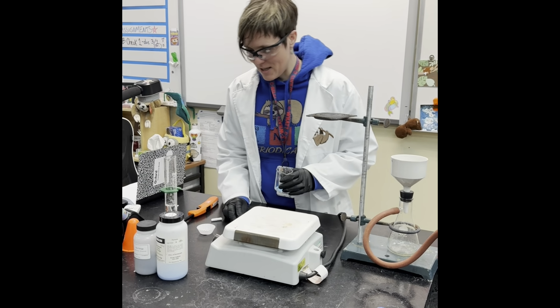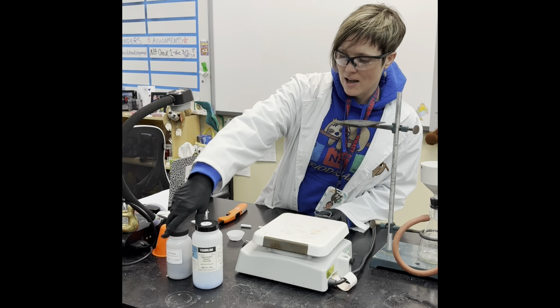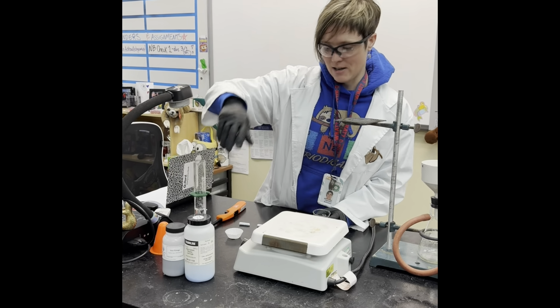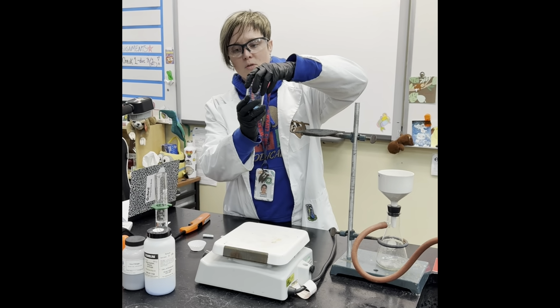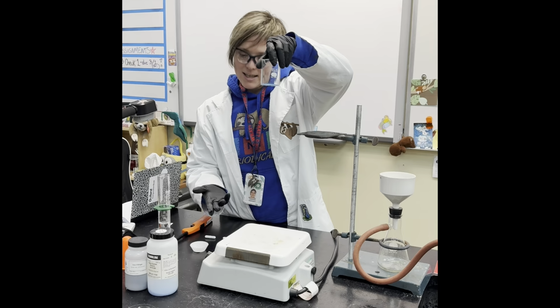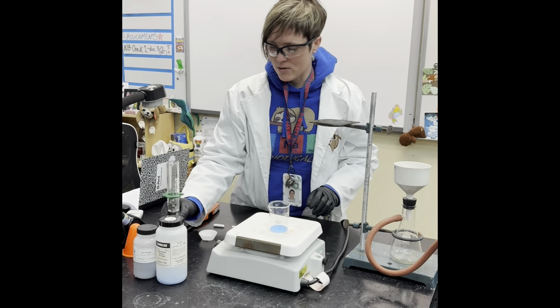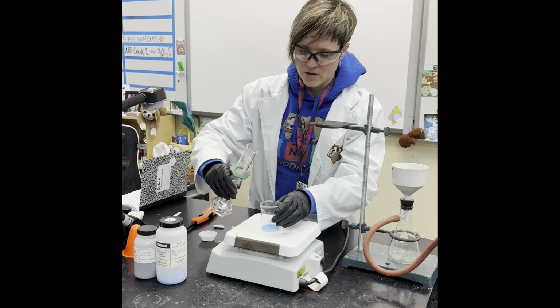All right, so today we are reacting copper(II) sulfate with some iron filings in a reaction where you're going to identify what type of reaction it is. I've already weighed out my copper(II) sulfate, exactly 3.00 grams. I'm going to dissolve that in some water because the solids won't react just by themselves.